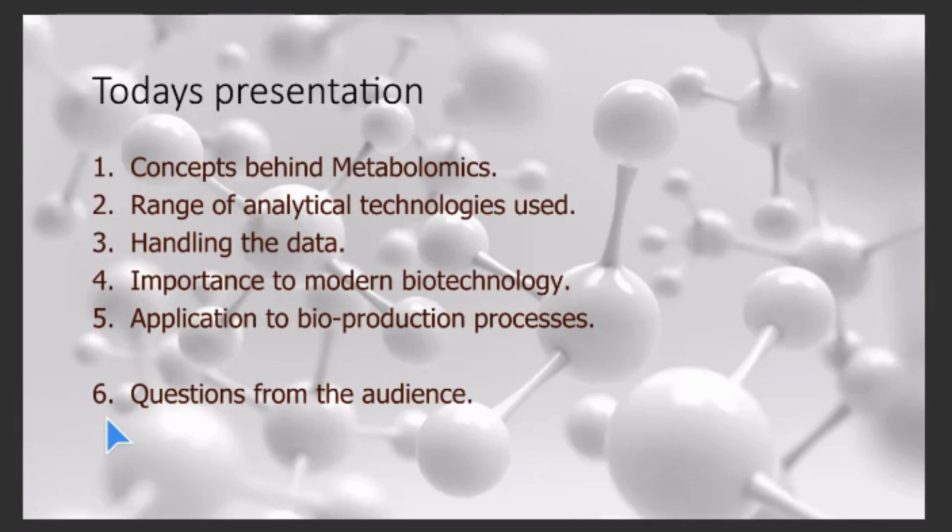I'll be talking about the range of analytical technologies that we can actually use to study metabolomics. And again, these analytical technologies are very broad, and I won't be able to do justice to all of them, or perhaps even the ones I'm going to mention. So again, there's a lot of technical detail behind that that you may want to go away and look up yourself, and there's lots of good papers around to do such things, some of which I'll be referencing.